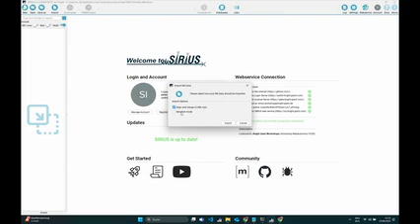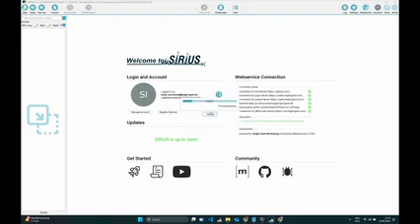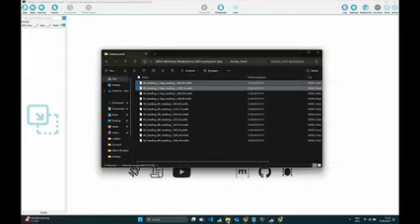There's also another setting, but this is probably not important for you. It's only to keep some low-intensive MS-only features. But yeah, for most purposes, you will probably just want to keep that as default. You will want to align your runs and then just click on import. This will take now a little while, so this is now doing everything that Markus explained. And as Markus said, you don't have to make any settings here. Everything will run automatically. While this is loading, let's look at some of the stuff that we have.